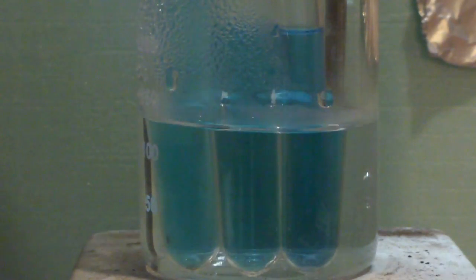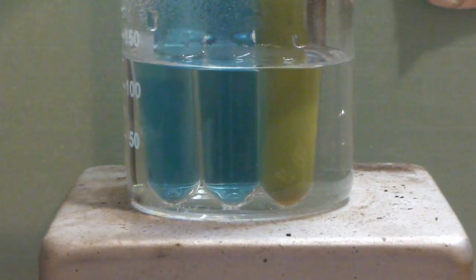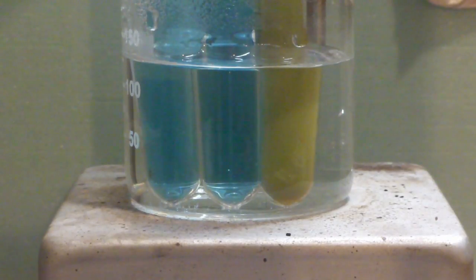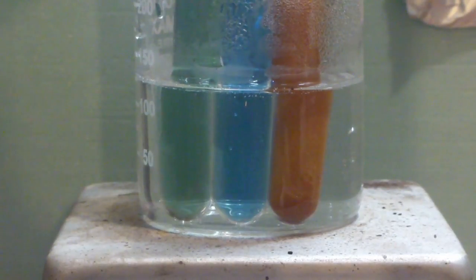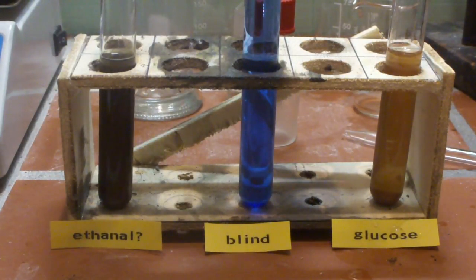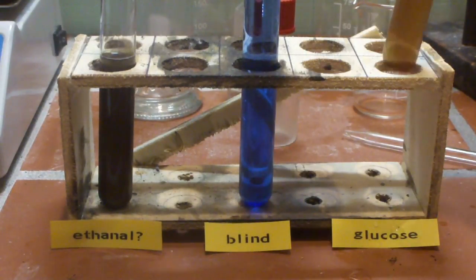Placing the test tubes in some boiling hot water will greatly improve reaction speed. As you can see, the glucose solution will react the fastest. After some time, the acetaldehyde solution will also react and prove that we have some kind of reducing agent in solution. The only candidate for this is acetaldehyde, so we have proven that the dehydrogenation of ethanol is possible. During the Fehling's test, acetaldehyde gets oxidized to acetic acid, while the complexed copper 2+ ions get reduced to copper 1 oxide.